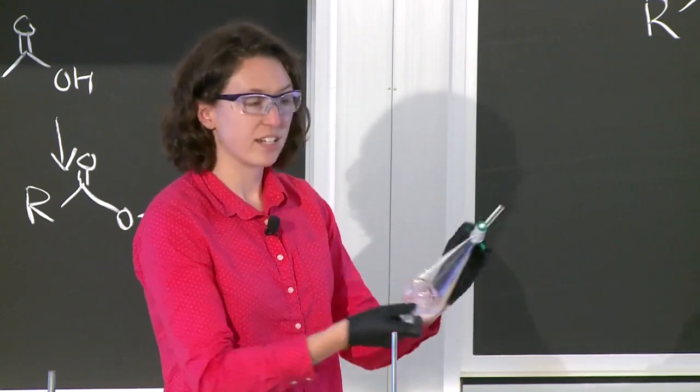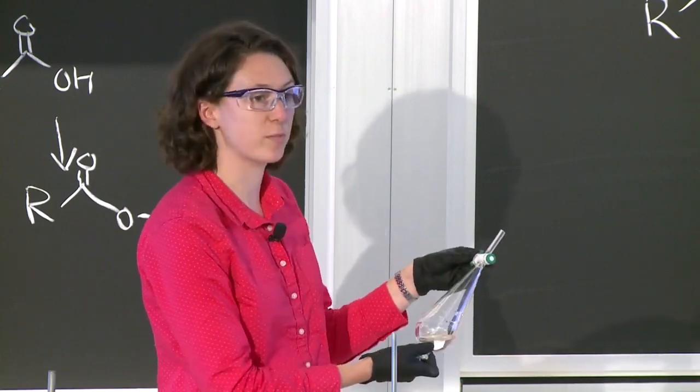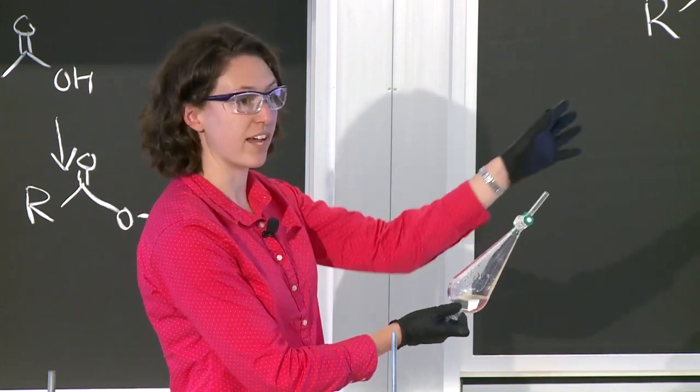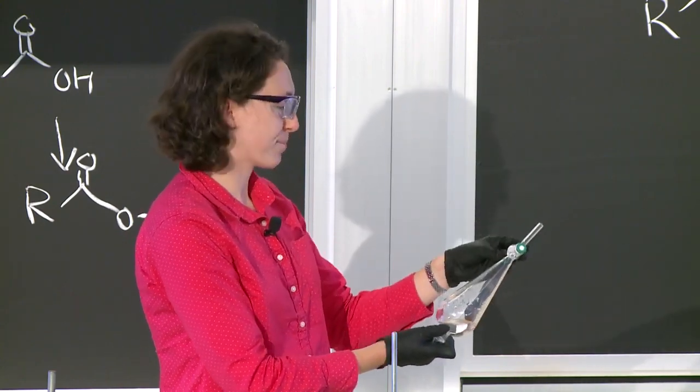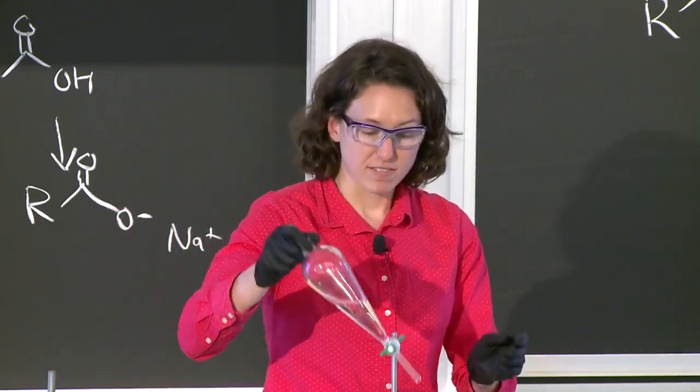So you're going to shake it a little bit, vent it. When you first start, you want to vent it very frequently so that the pressure doesn't have a chance to build up. When you do this, you want to point it away because sometimes liquid will come flying out. You'll hear it. It'll go psh. So you want to be very careful when you are using this. Safety note.